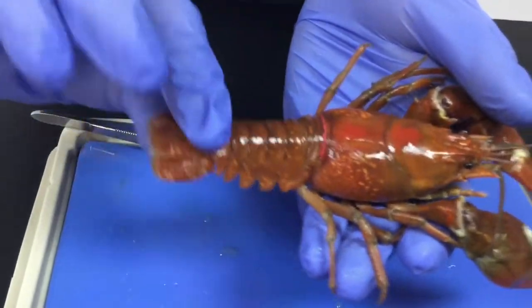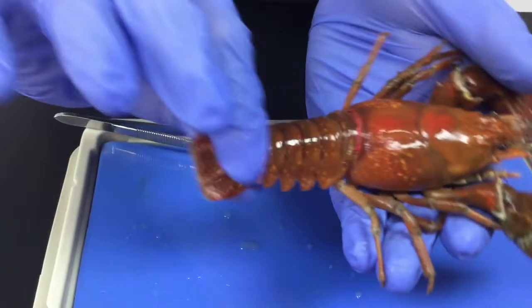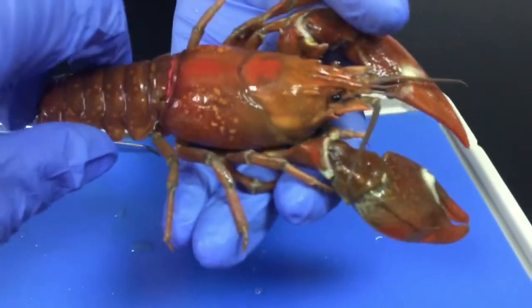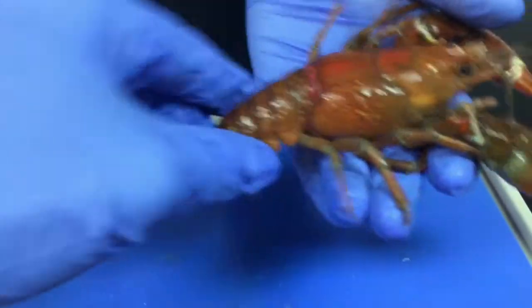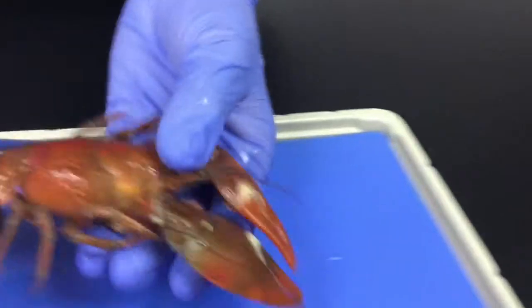What would it do to help the crayfish? Help it to swim. Yeah, it could help it swim. It actually could help it swim backwards. It's like, getting away. No, I want to get away.